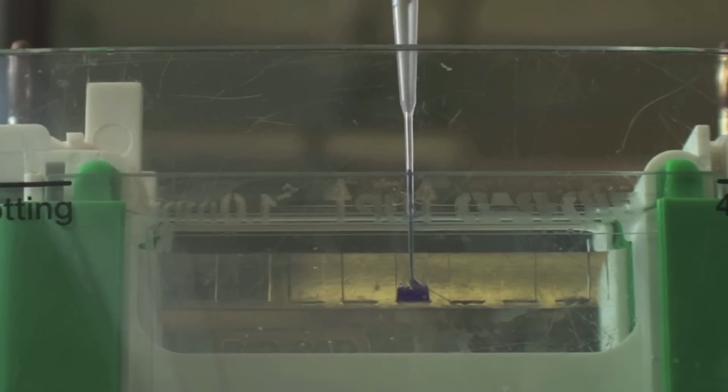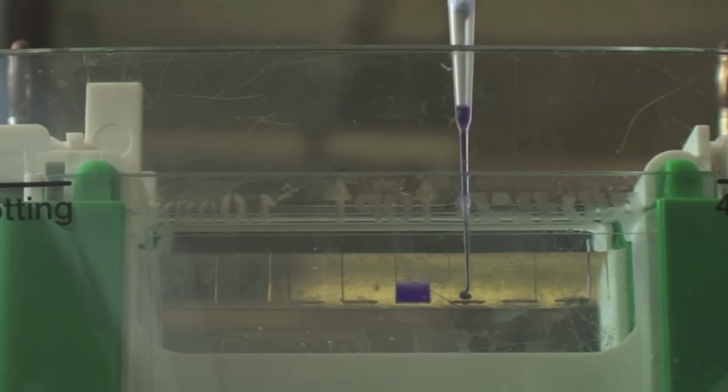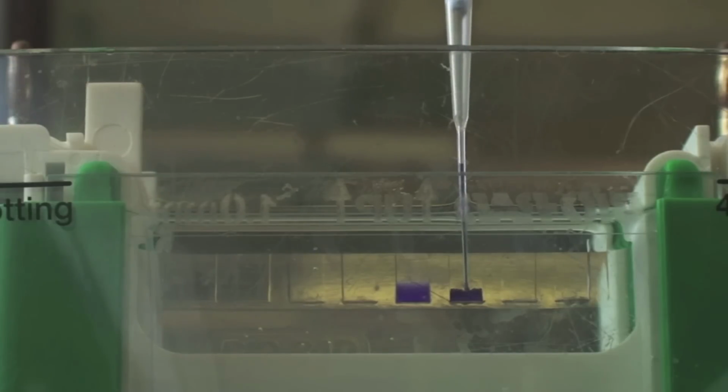The pipette tip should be inserted into the well in between the plates, deep enough to prevent overflow of the sample to the neighboring lanes. Slowly release the sample solution into the lane. When complete, remove the pipette tip, change the tip, then load another sample.